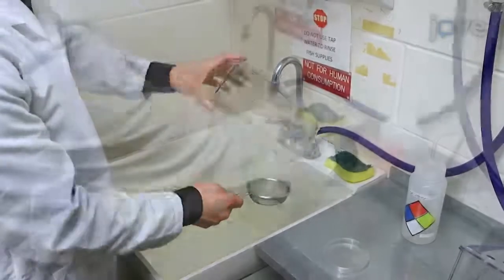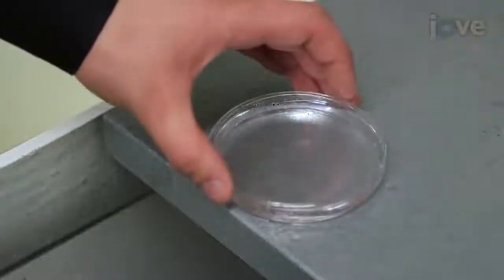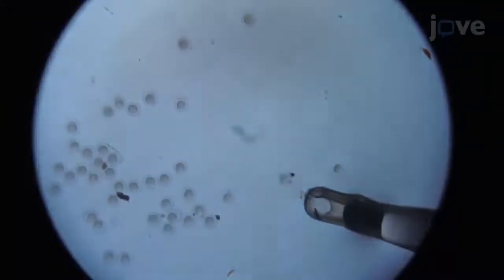Once the fish have laid eggs, collect them in a 10 centimeter diameter petri dish. Immediately under the dissection microscope, remove all abnormal embryos and fish waste.